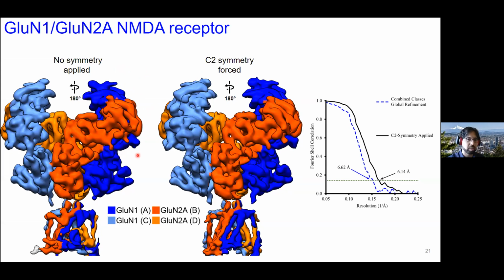So now we were wondering, okay, is this an artifact of data analysis? Does the receptor actually have symmetry, but due to some heterogeneity in our particles, we are seeing this false pseudo-symmetric state? Or is this something real? Is this something that's a function of the receptor?